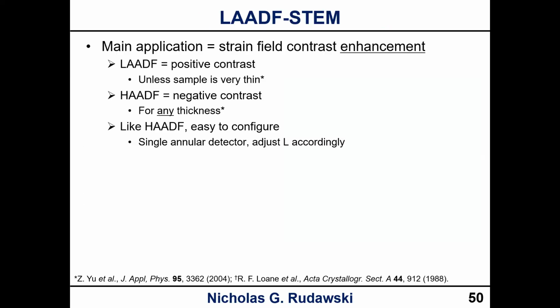Okay, so just to summarize LAADF. The main application, in my opinion, is as a strain field contrast enhancement technique. In LAADF, you're going to have positive contrast from strain fields. The only caveat to that, and there's a great paper about this, which you can see below, is if your sample is very thin, then LAADF is actually going to give you negative contrast, but by and large, it's going to give you positive contrast. HAADF is always going to give you negative contrast, regardless of the thickness.